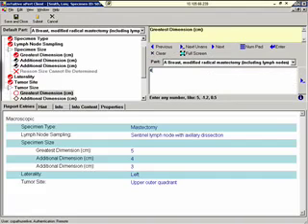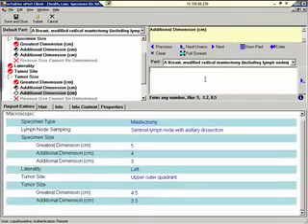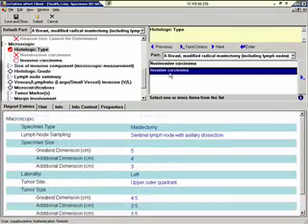Greatest dimension, 4.5. Additional dimension, 3.5. Final additional dimension, 3.5. Histologic type. In a moment we're going to select invasive carcinoma. But as you can see right now, non-invasive carcinoma and invasive carcinoma are both turned off. Let's click Enter to select invasive carcinoma.